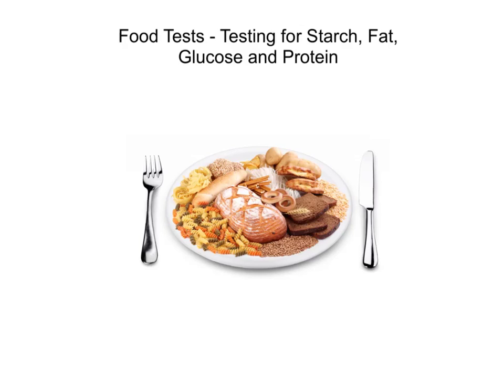Hello everyone. In this video we're going to talk about a few of the food tests that you do at key stage 3 and 4. So we're going to talk about the one for starch, the one for fat, for glucose and for protein.